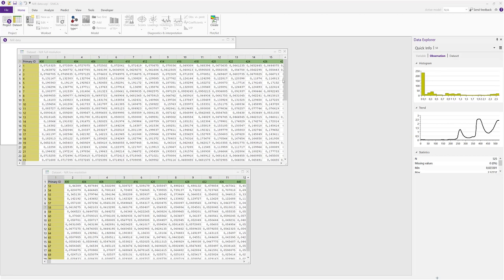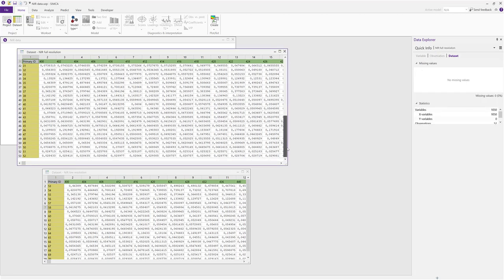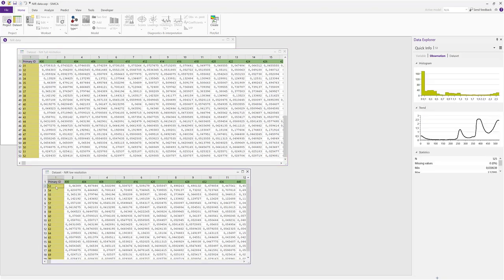The higher resolution data set contains observations up to 52. If I scroll down, the lower resolution data set has observation numbers higher than 52, and this is just so that we can see that they are merged later on. In this setup we have an exact match of wavelengths, so every wavelength in the lower resolution can be found in the higher resolution data set, but that is of course not necessary for the merging.